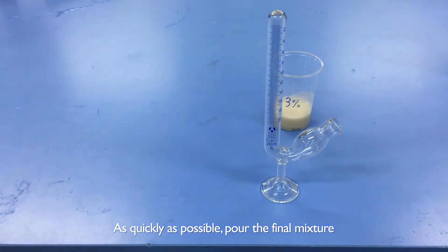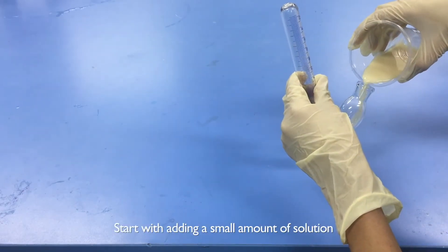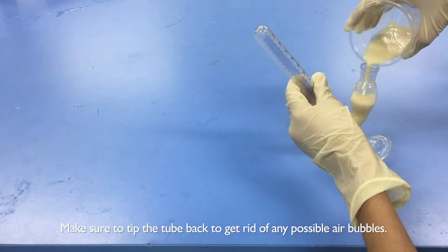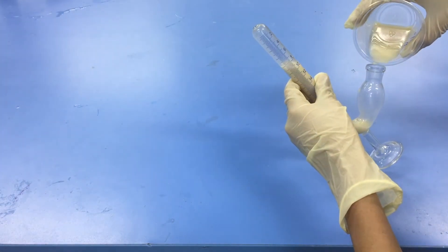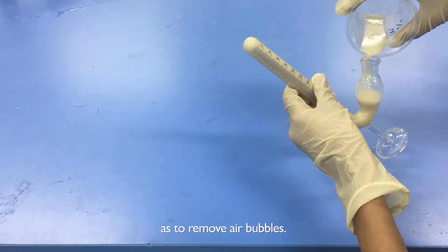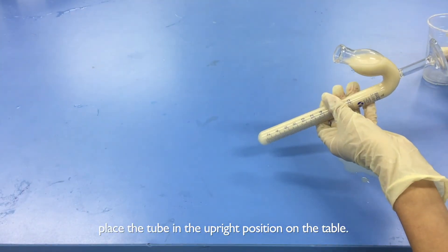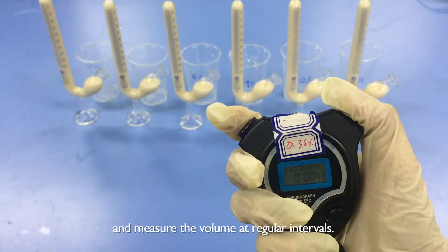As quickly as possible, pour the final mixture into all fermentation tubes. Start with adding a small amount of solution to the fermentation tube. Make sure to tip the tube back and get rid of any possible air bubbles. Add the rest of the mixture, constantly keeping the tube tilted as to remove air bubbles. When all the liquid is added, place the tube in the upright position on the table. Start the stopwatch and measure the volume at regular intervals.